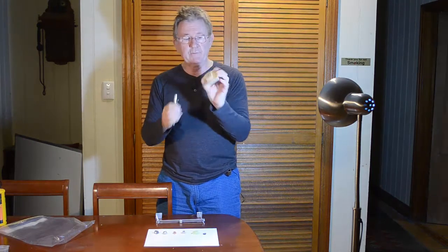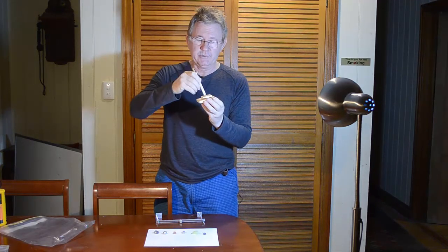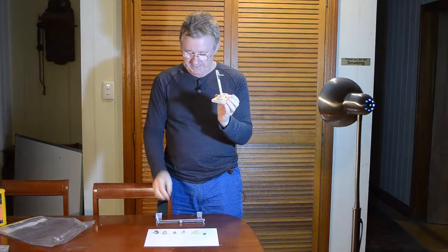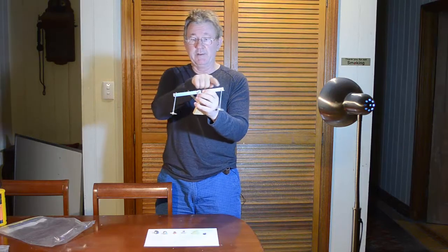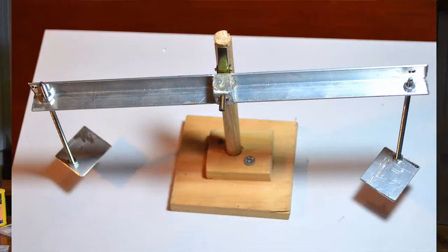We've got the base with a hole in it. We've got the post, which goes here, and there's a little metal screw coming out. And this is the shaft, the aluminium beam, and 2 shafts coming down. So we just put the screw through the hole, and this has been pretty well balanced so that they're equalised. There's an equal weight on both sides.